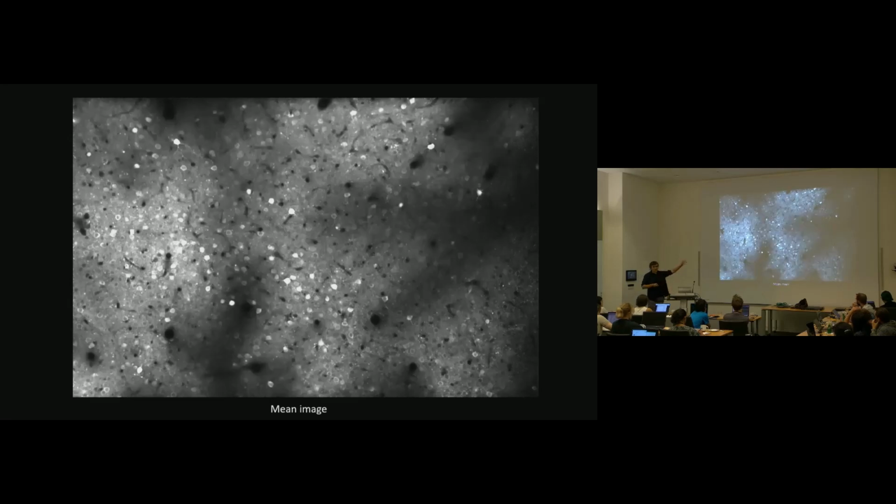Now, this back and forth that I'm doing here is something that we do a lot in the GUI in suite2p. We have a lot more images like this that you can quickly switch back and forth between, and it really helps you track the same cell in different views to get more information about whether that is really an ROI, or is it some piece of another ROI? Is that really two cells? Again, our visual system is really good at identifying problems.